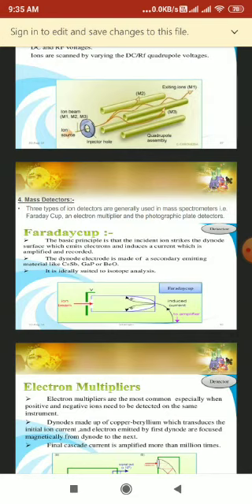It is a simple and least sensitive detector used in mass spectrometers where extreme sensitivity is not needed. It consists of an insulated conductor directly connected to an electrometer amplifier. Its cup shape reduces the chances of escape of secondary electrons liberated by the ion impact.